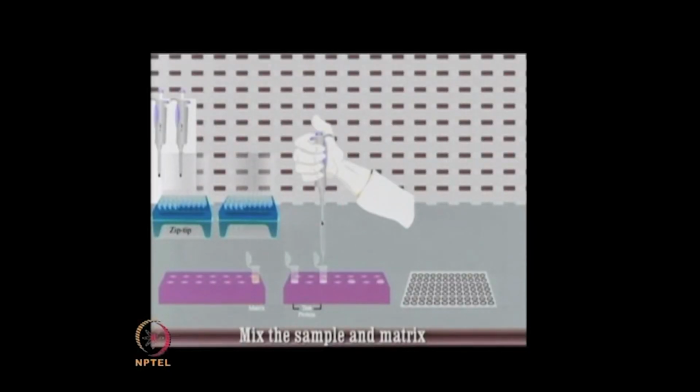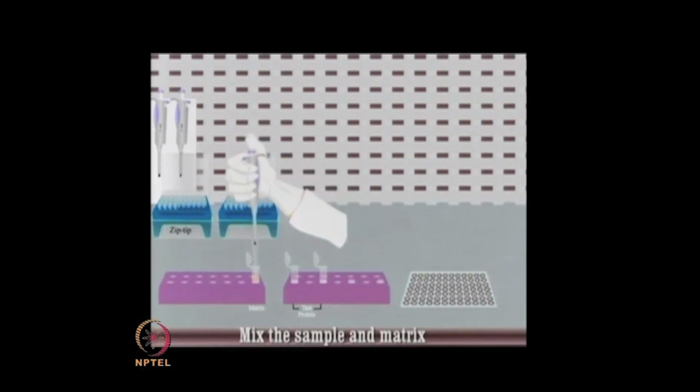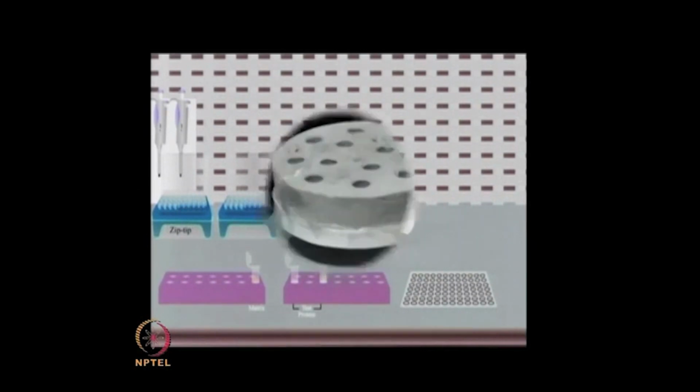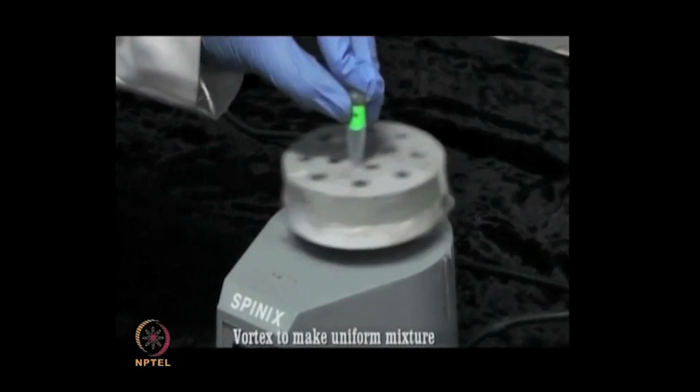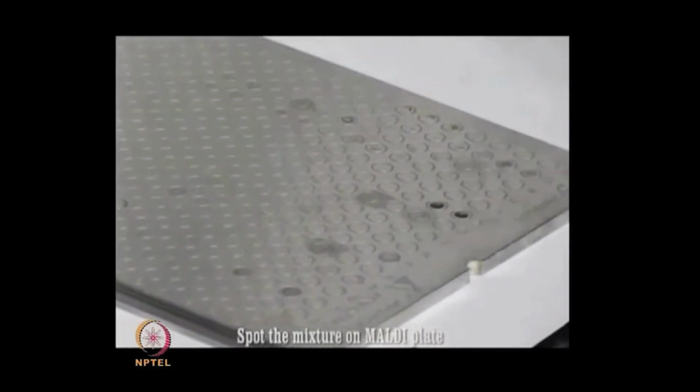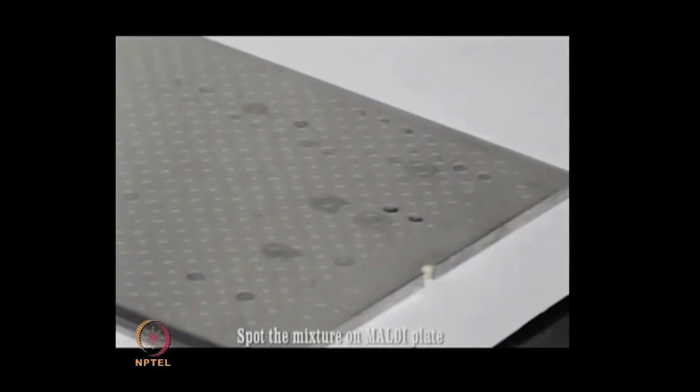MALDI is performed in two steps. In the first step, the compound for the analysis should be dissolved in a solvent containing small organic molecules known as matrix. This mixture is dried before analysis, and the liquid solvent used in the preparation of the solution is removed. So, in this video, by depicting the matrix preparation as well as instrumentation, we will try to give you an overview of the MALDI-TOF instrumentation.